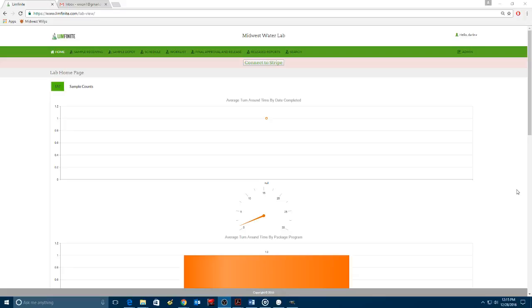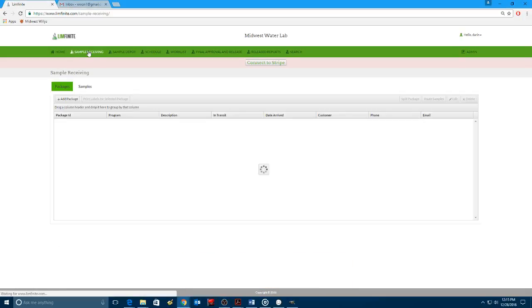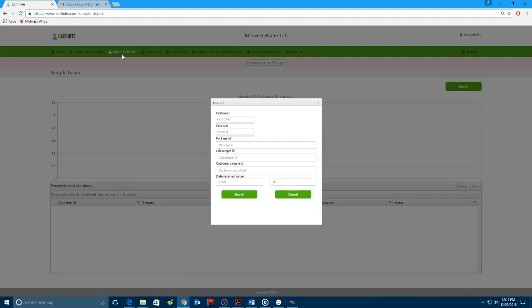In this video, I'm going to mark the samples that I just created in sample receiving and routed to sample depot or to sample prep as having been prepped. So let's say I was a sample prep worker and I prepared the samples for the chemists. I might grind them, or I might mix them with something, or who knows what I would do, because it just depends on the sample and what the SOP says to do.